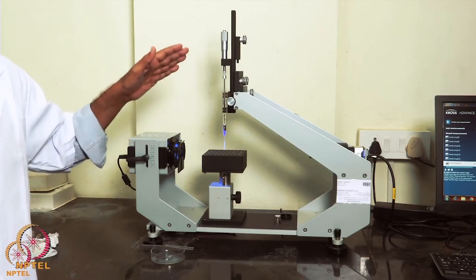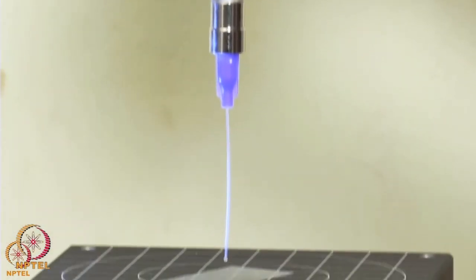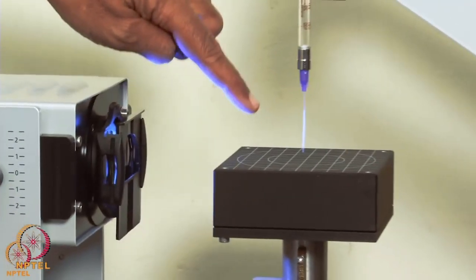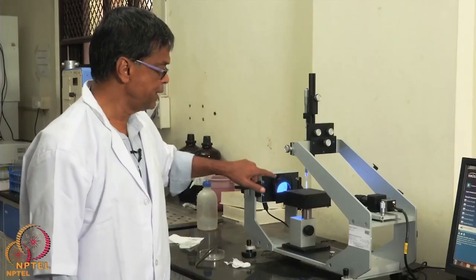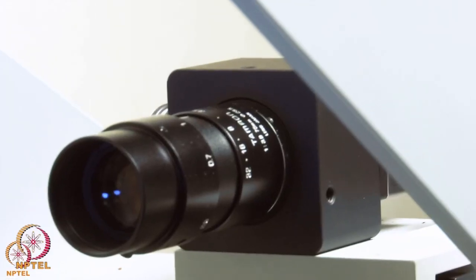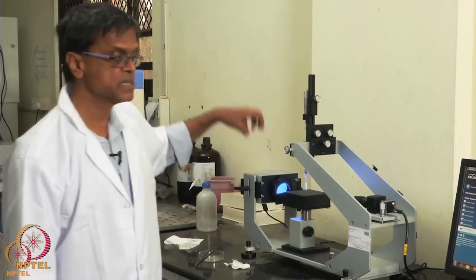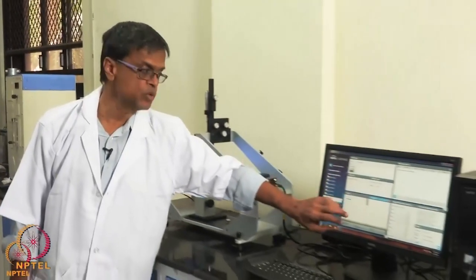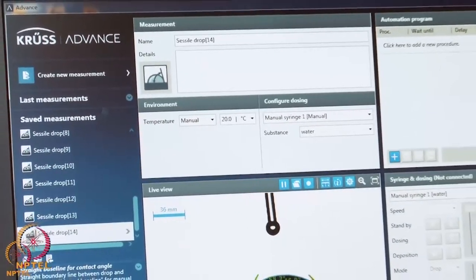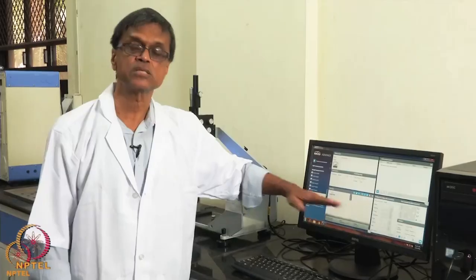This is a goniometer — a very simple setup. We can place a drop of ultra pure water on a surface. It could be a polymer surface or a metal surface. There is a light passing through and a camera which captures the droplet and the angle it makes, and it comes onto your computer screen where the software helps you calculate the angle the water droplet makes on the surface.